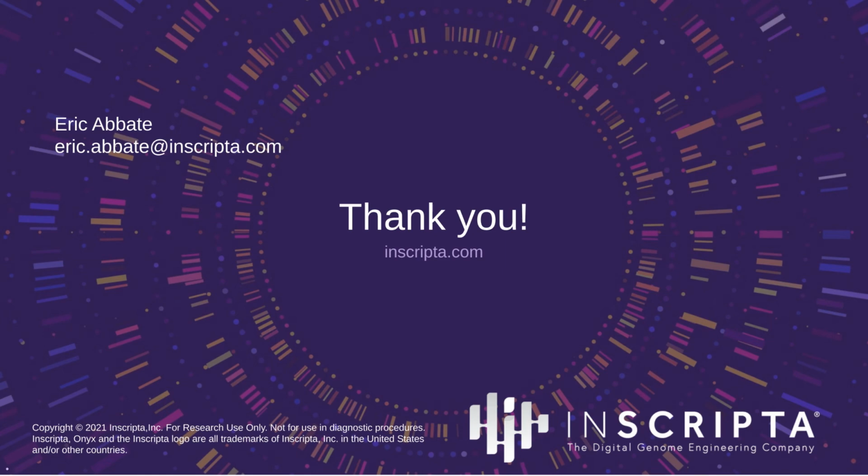Thank you. Next question. If you have multiple copies of the same expression cassette in the genome, will the edits designed within the cassette actually be done to all these copies? Yes, another good question. For heterologous protein production, very often you have multiple copies of a gene. To answer your question, you will get editing at some number of the locations.